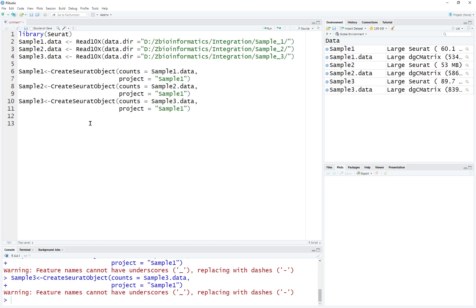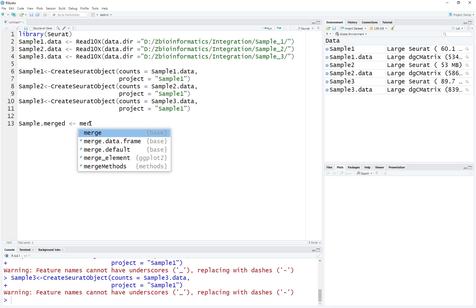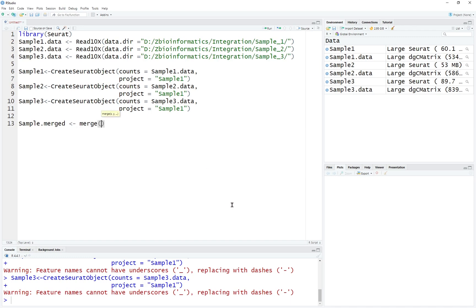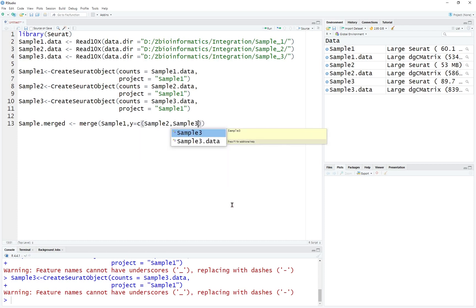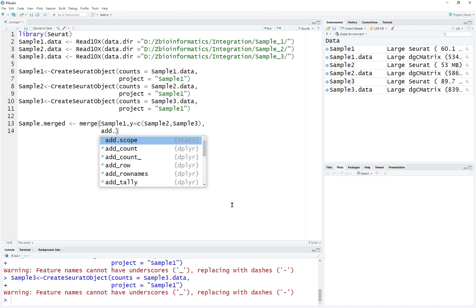Next, we're going to merge the samples. The sample merged variable will be a new Seurat object. We're going to use the merge function — merge sample 1 as the input, and the things we're going to merge with sample 1 are sample 2 and sample 3. We're going to add the cell ID, which you can name as sample 1, sample 2, sample 3. But if you're dealing with experimental data, you can label them as control, test, normal, or cancer data — that depends on your dataset.